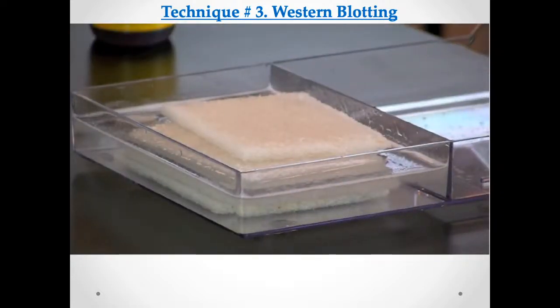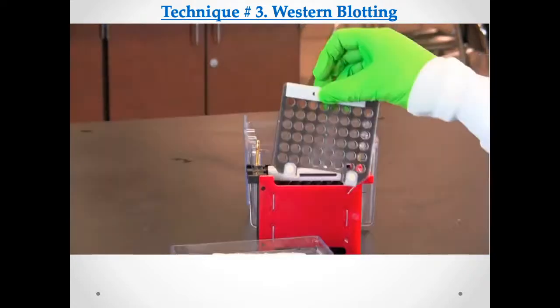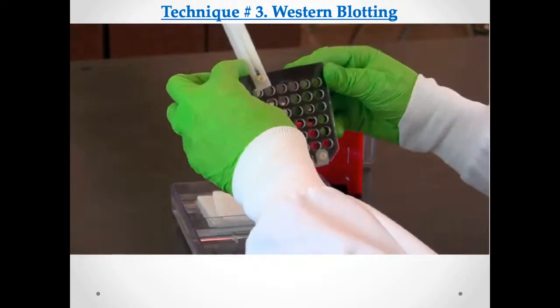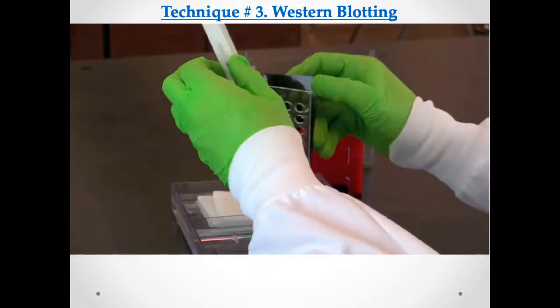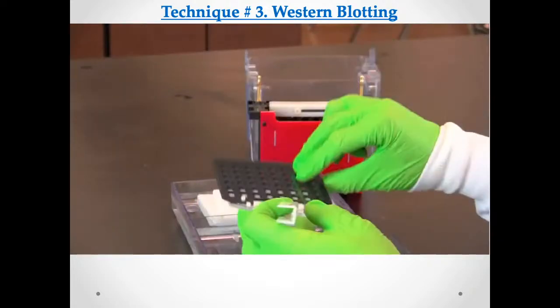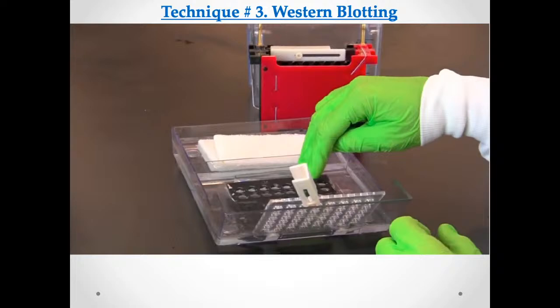Pre-soak fiber pads in blotting buffer so that they are thoroughly soaked. To make a blotting sandwich, obtain a container large enough to fit the gel holder and add enough blotting buffer until the container is filled approximately 1 centimeter deep. Place the gel holder cassette in the container with the black side down and immersed in the buffer and the white side up and out of the buffer.